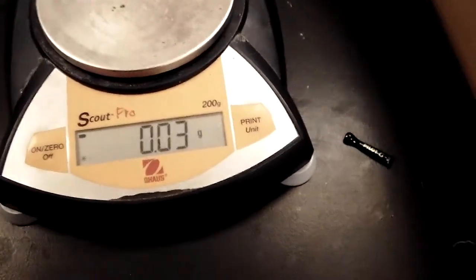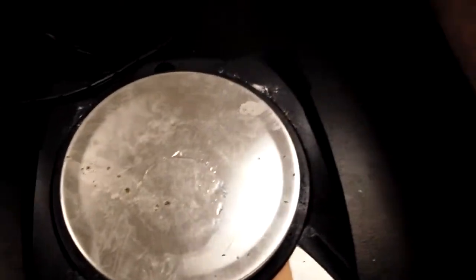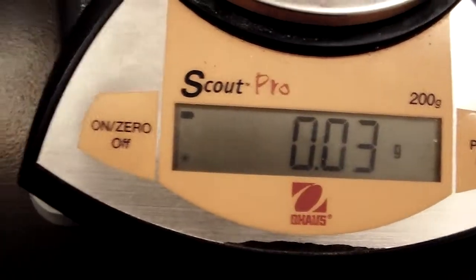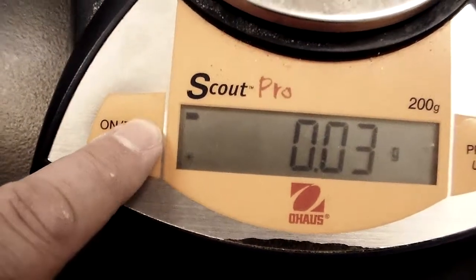You may notice it's not set at zero — that's because there's a little bit of water on it. If you don't care about the water and just want to re-zero it, there's a re-zero button right here. Press that and it zeros itself out, and you're ready to weigh again.